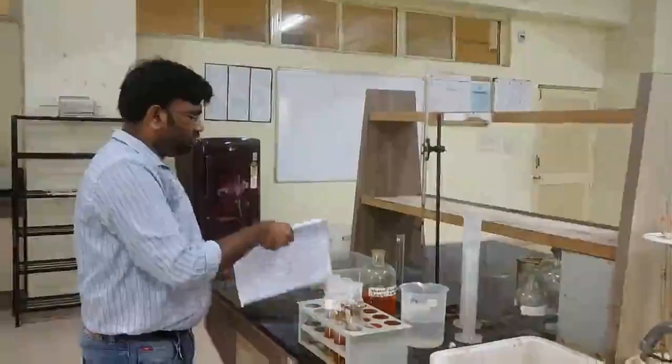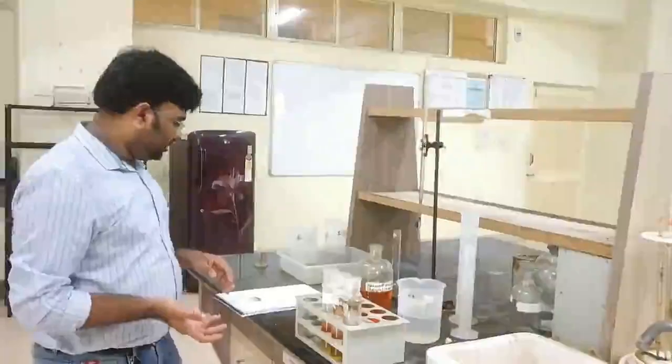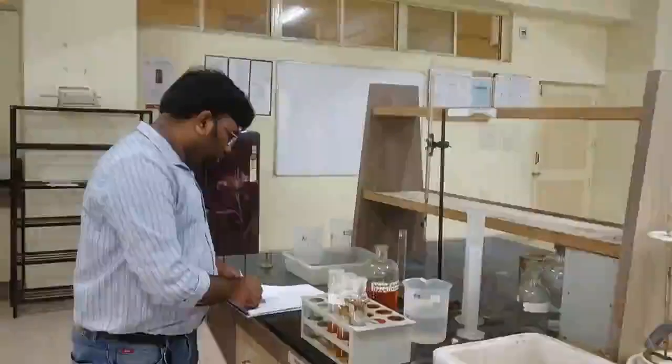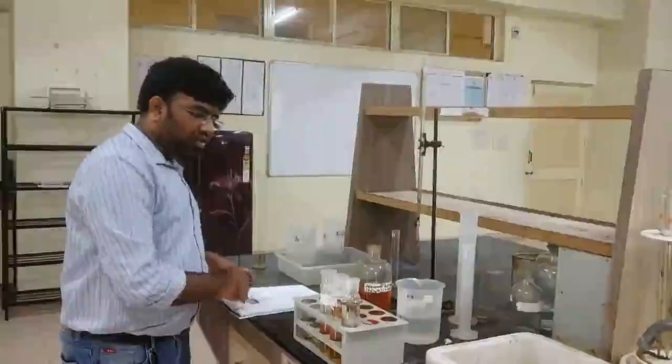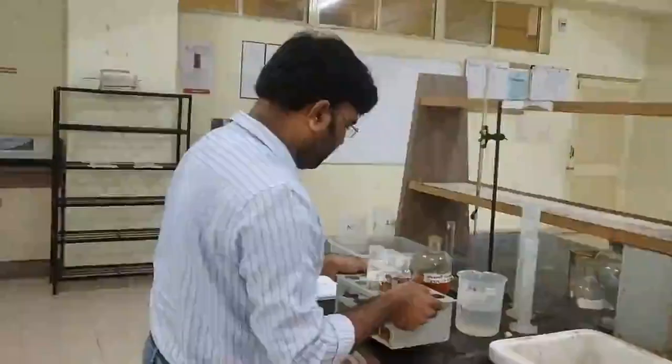So the next procedure according to the manual is we'll have to attach the reflux condensers. We are going to particularly attach the reflux condenser. So I'll be directly taking it towards the COD digester that we have in our lab.